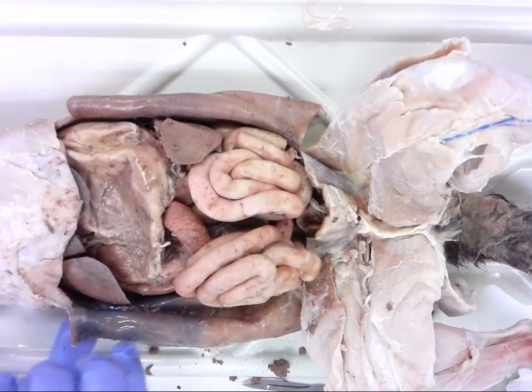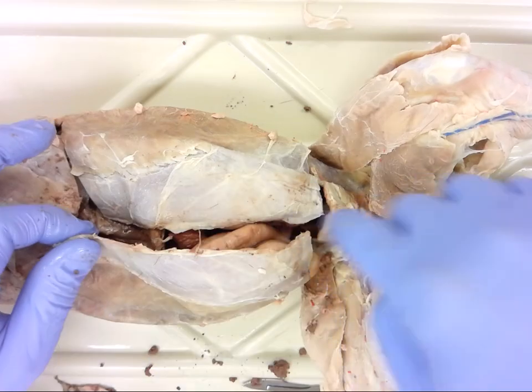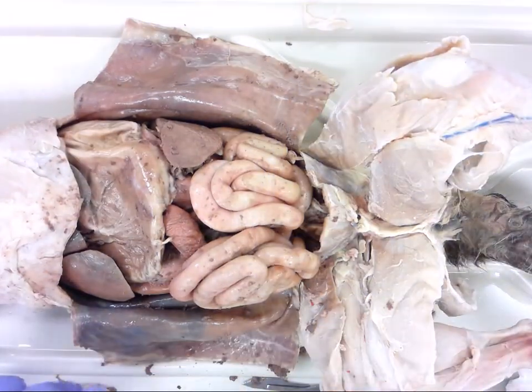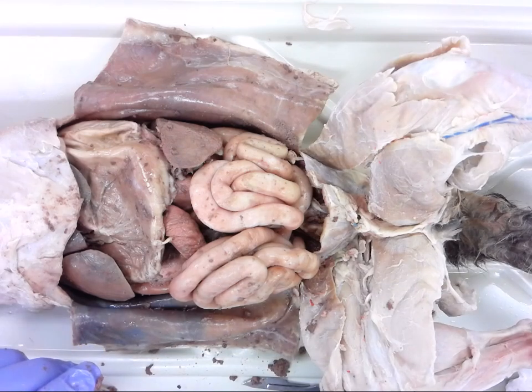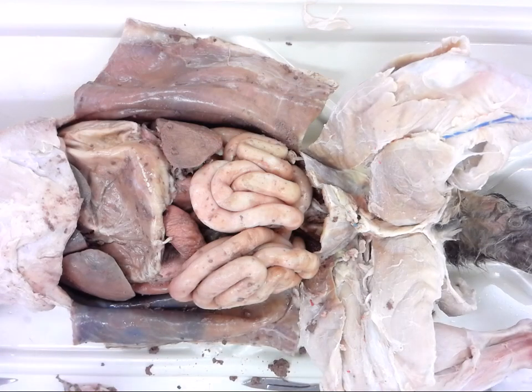So once again, we have our abdominal contents. Make your incision down the middle and then down each side, so that way you can open it up very easily and gain good access to your abdominal contents. I will go through more detail on the specifics as we get into other videos.